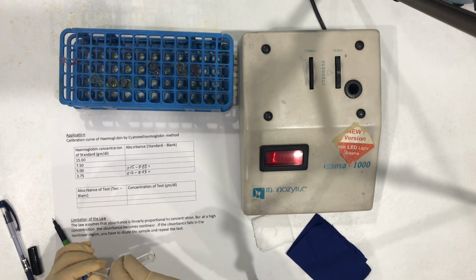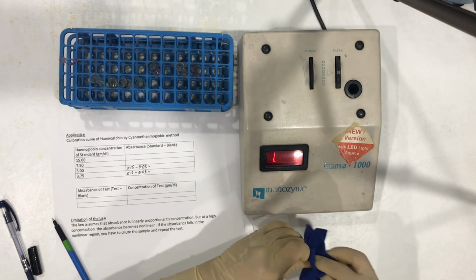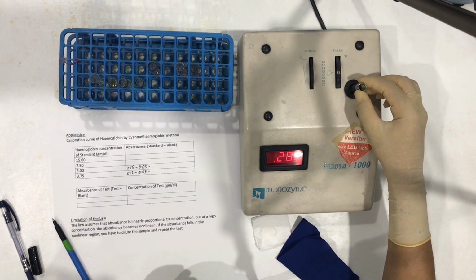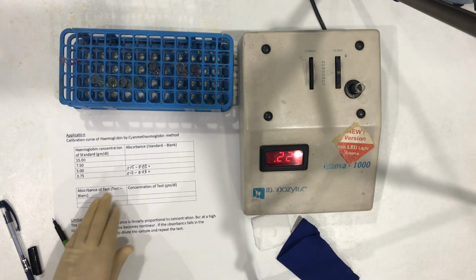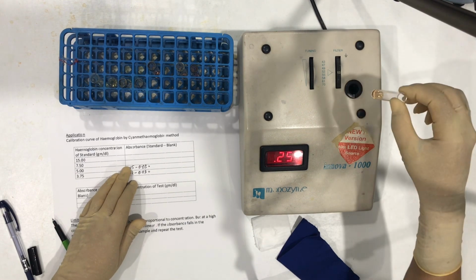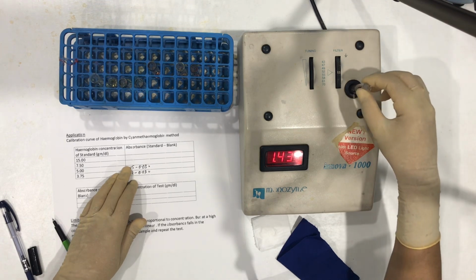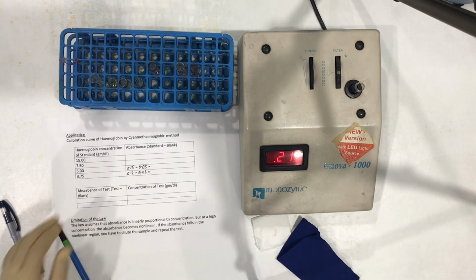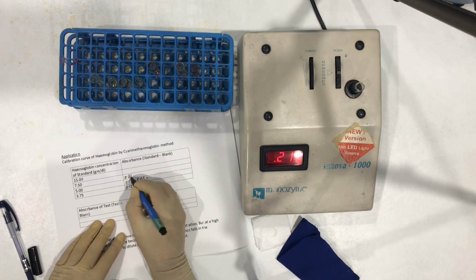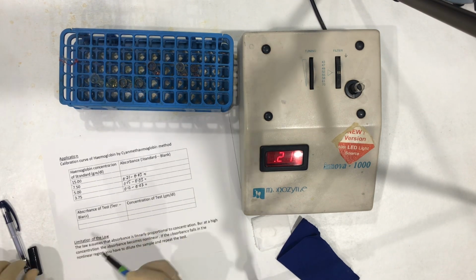Concentration of third standard is 7.50. 7.50 is giving absorbance of 0.21. 0.21 minus 0.03, that is absorbance of blank.